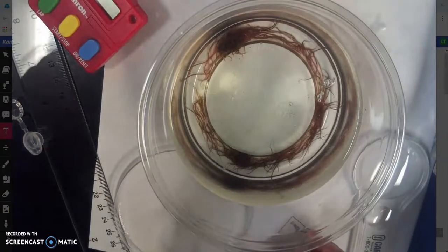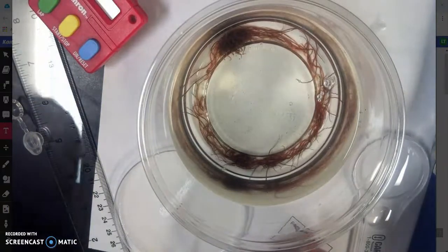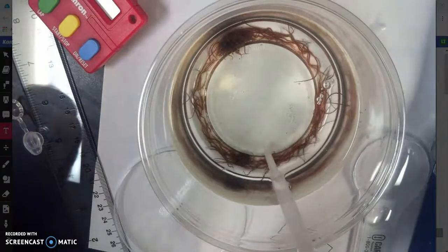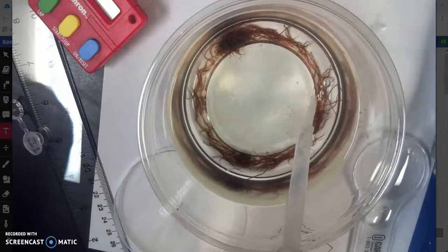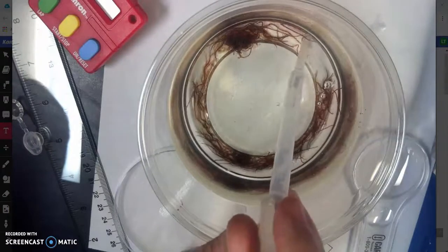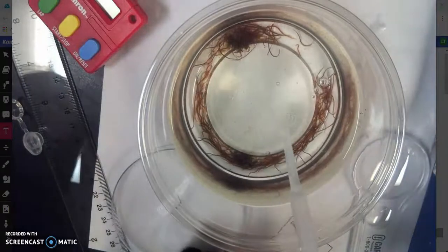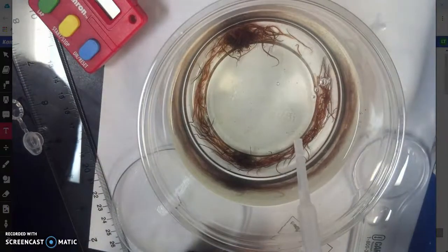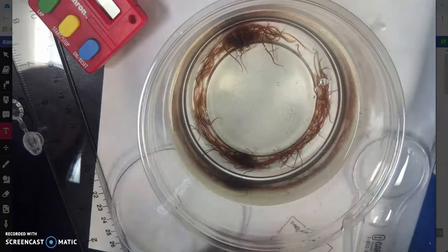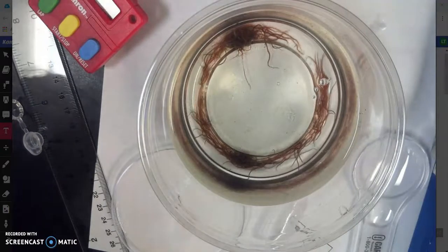because they don't want to attract predators. And so they have some unique behaviors, the way they swim, the way they move, when they feel like they're under attack, like right here. You see I just barely get close to some of them and they start making that really quick reflex jerking motion, as you might notice there. Okay, there are some unique things that the blackworms do, and we're going to be reading about them in our next reading selection. But one of the characteristics about them we're going to focus on today is reproduction.